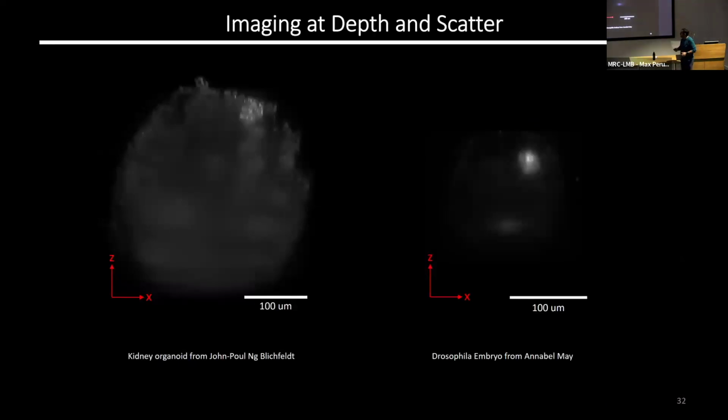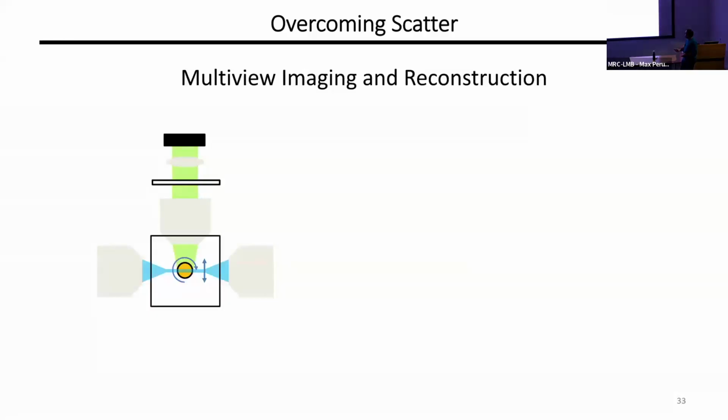Okay, there is, however, an issue, which is scattering. So if you're imaging a sample that has a large volume, as you realize here, this is a Z stack. This would be the result of a Z stack here. And this would be where the objective would be. And the image starts to be very crisp, but at some point, light starts to scatter. And then you end up with a blurry image there. And this is exactly the same. So this is crisper than this one here. So how to solve this scattering problem specifically using a light sheet microscope?